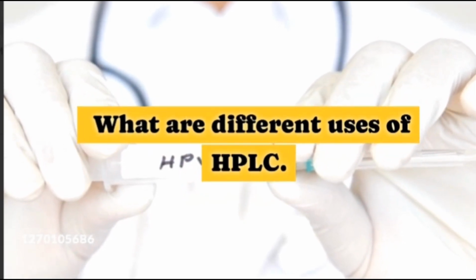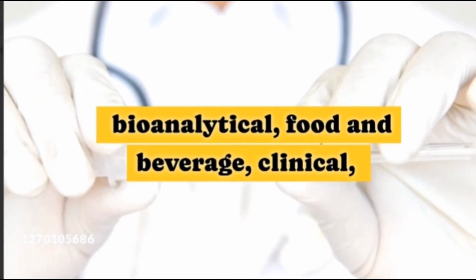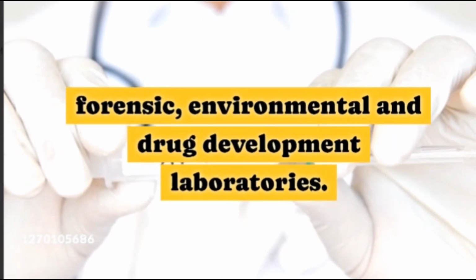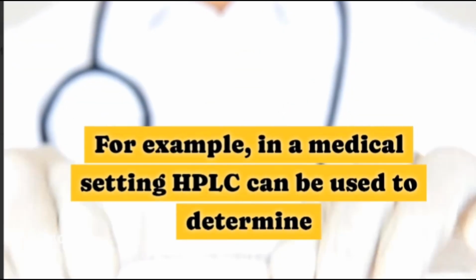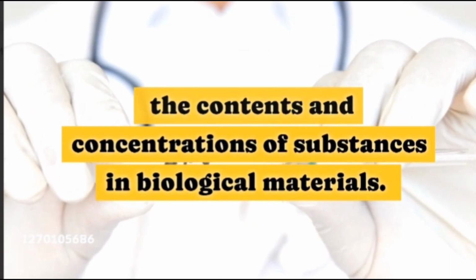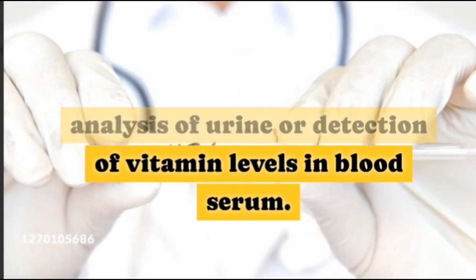What are different uses of HPLC? It has wide applications in areas such as pharmaceutical, bioanalytical, food and beverage, clinical, forensic, environmental and drug development laboratories. For example, in a medical setting, HPLC can be used to determine the contents and concentrations of substances in biological materials. This could include drug analysis of urine or detection of vitamin levels in blood serum.